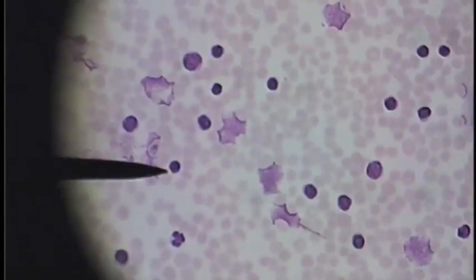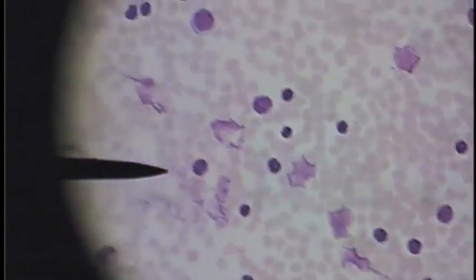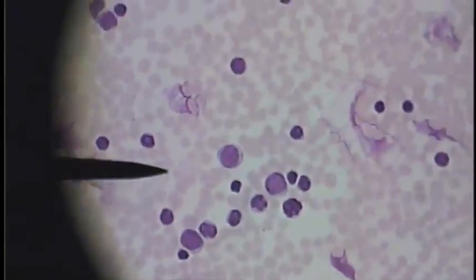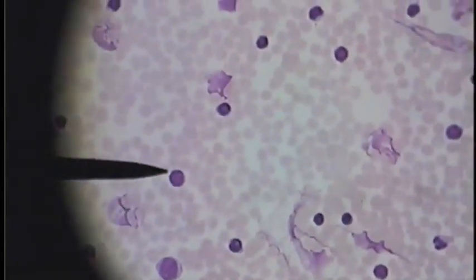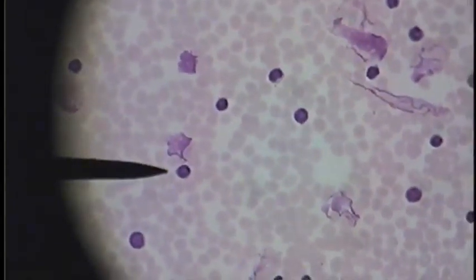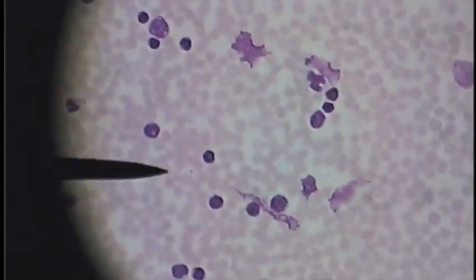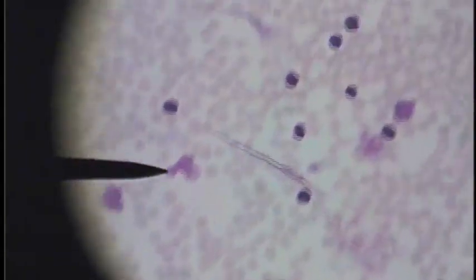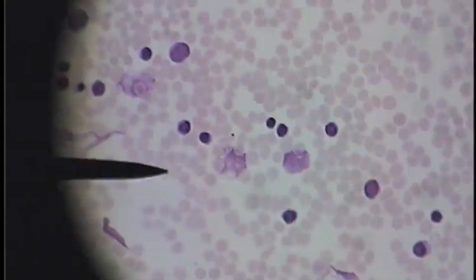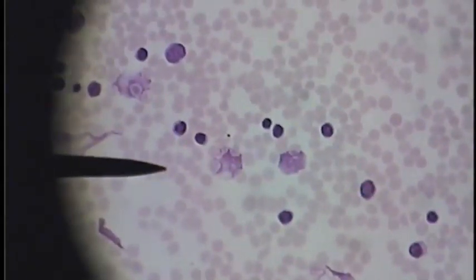Here we see normal red blood cells and too many white blood cells — way more than you would expect in the field of view, and immature cells at that. So this would be a leukemia. Anywhere we go there are too many white blood cells in the field of view; anything more than four would be too many.